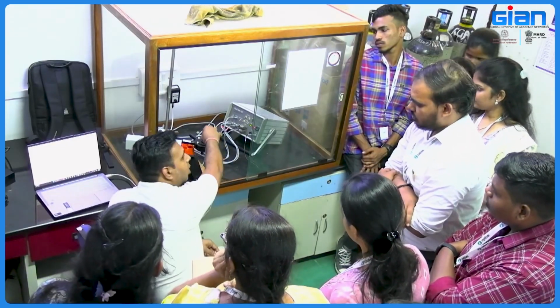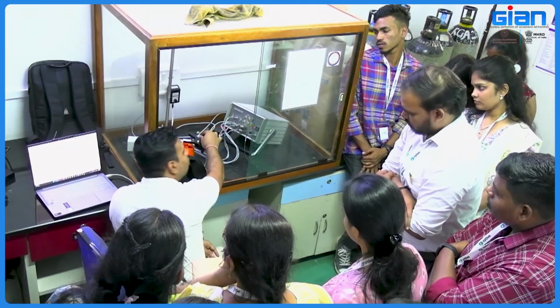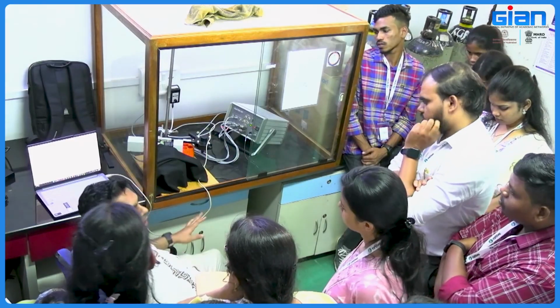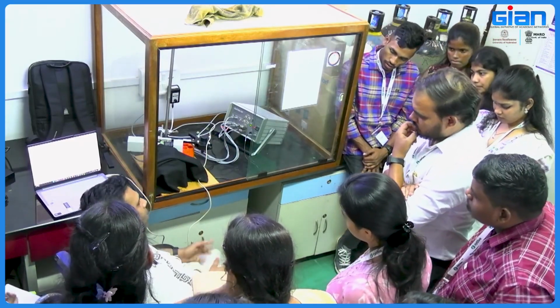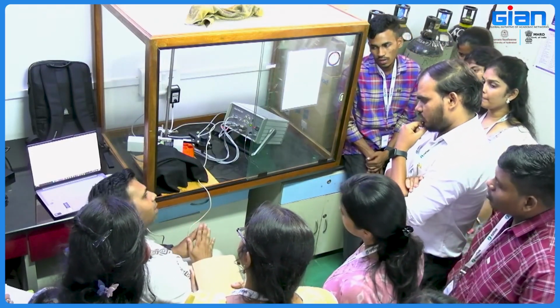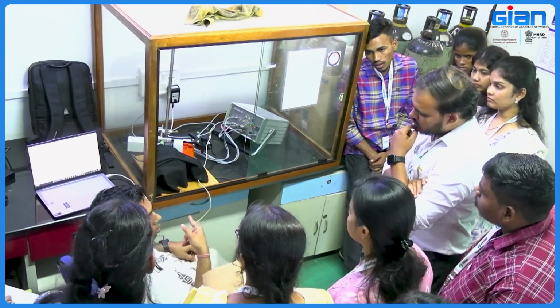Only the algal culture you need to put, after dark incubation, you can do it directly. Place it on, tighten it, and the running procedure will be exactly the same. Got it? In algal culture, you may not get P700 because if some cultures are growing in salt media, there will be some signal changes. But PS2 will record very properly. Got it? So, anyone wants to do a light curve?